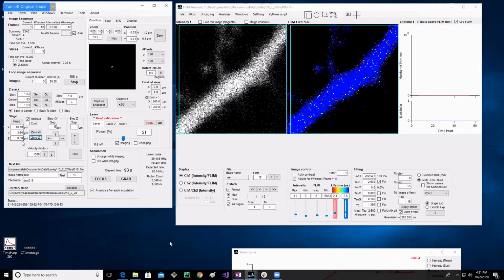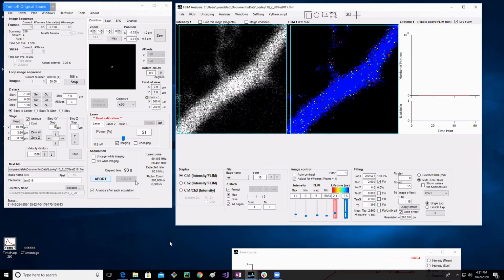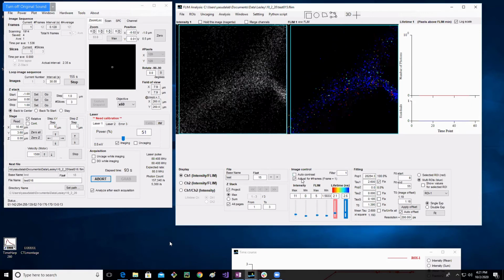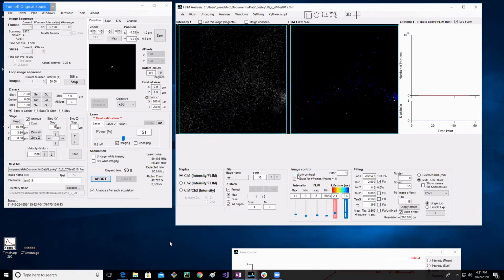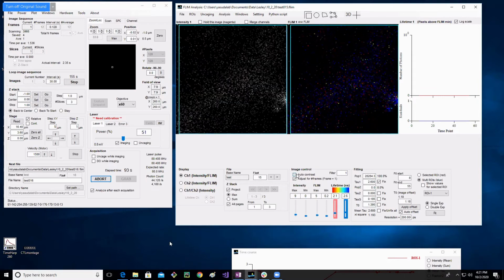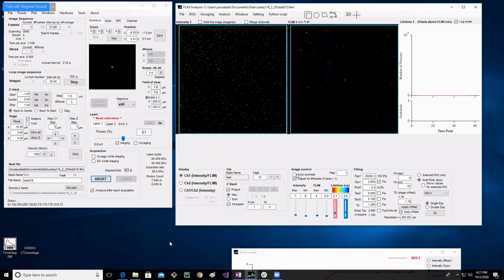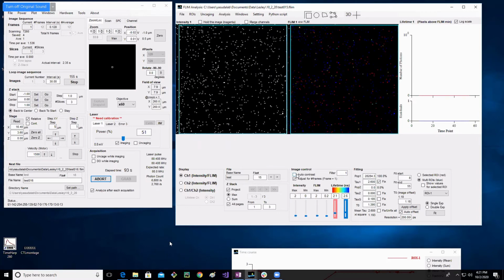And you'll see that that gives me a Z value of 0, okay? And then if I hit focus, I try to focus up to the top of the slice. When I'm doing that, I change the contrast by just hitting this auto contrast button so that there's more noise. Okay, and so I just hit it again so that I can see the noise really well.